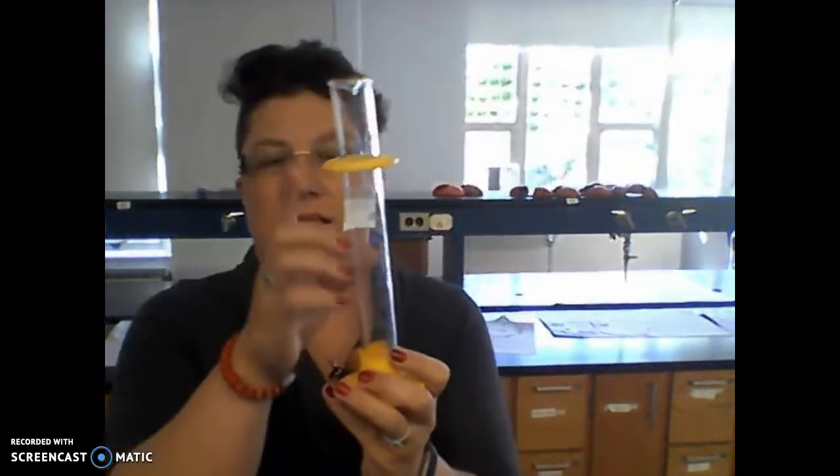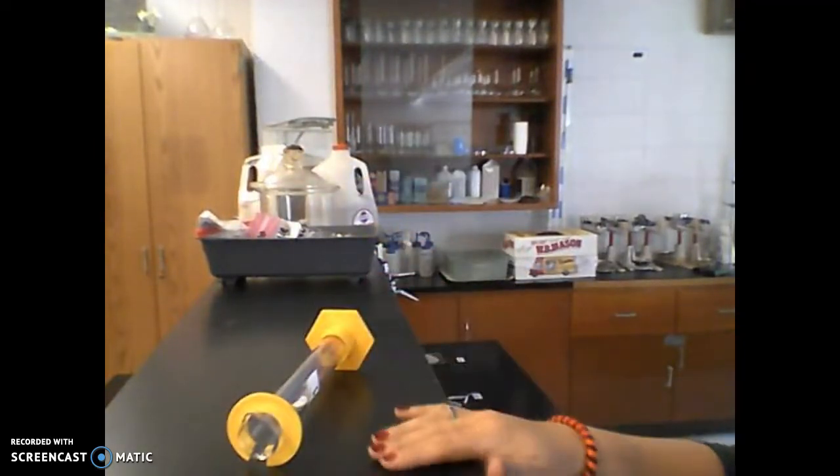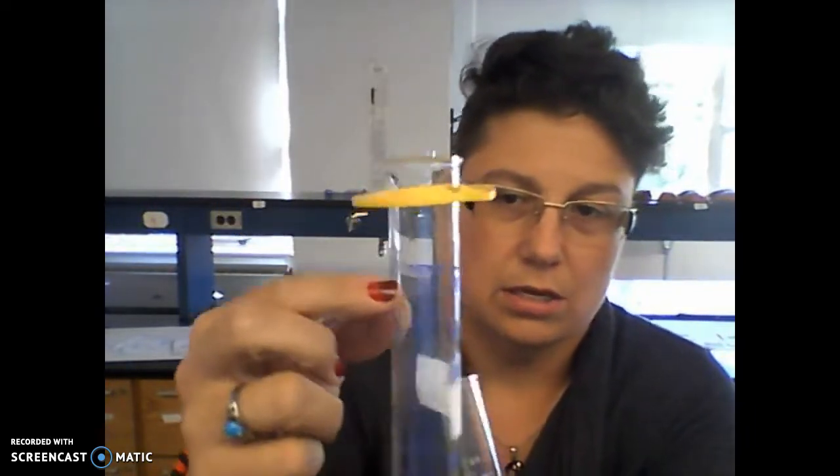What you will use is a graduated cylinder. A graduated cylinder is what you use to accurately measure volume. Usually there's a guard at the top — the guard is meant to protect it, not to measure. Keep the guard up at the top. When you knock it over, the guard protects it so it doesn't break. There are two different sizes: this one is 100 milliliters and this one is 25 milliliters.